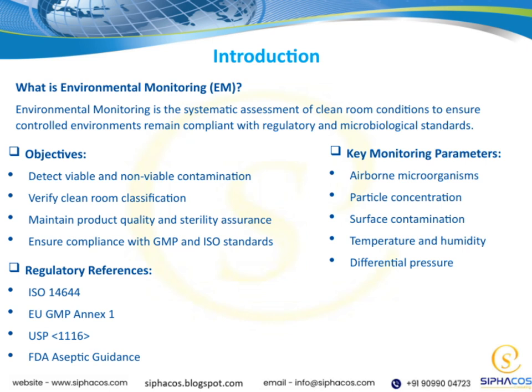Now, let's define what environmental monitoring really is. It's a systematic assessment of our clean room conditions, regular, thorough checks to make sure that our controlled environments stay within the necessary microbiological and regulatory standards. By doing this, we ensure that the environment remains safe and suitable for manufacturing, protecting both product integrity and patient safety. Throughout this presentation, keep in mind that effective environmental monitoring is the backbone of maintaining high-quality, compliant, and sterile production environments.